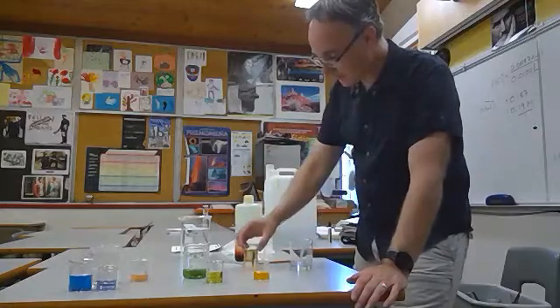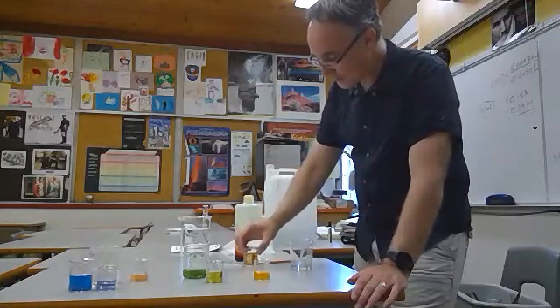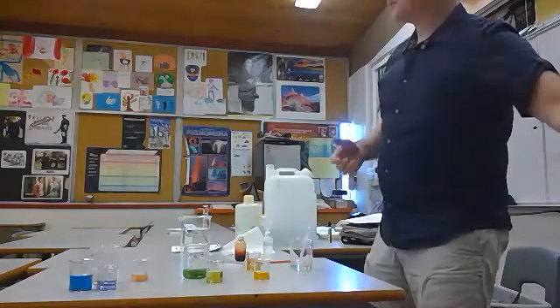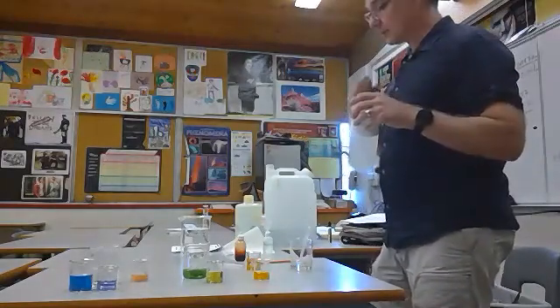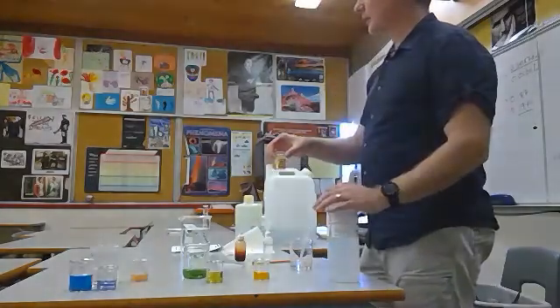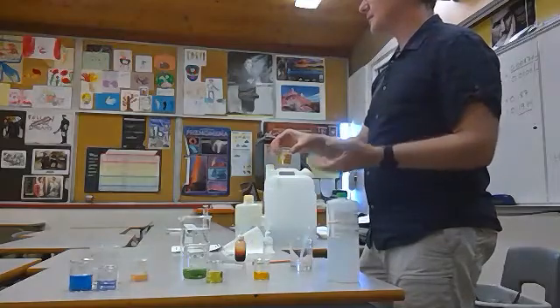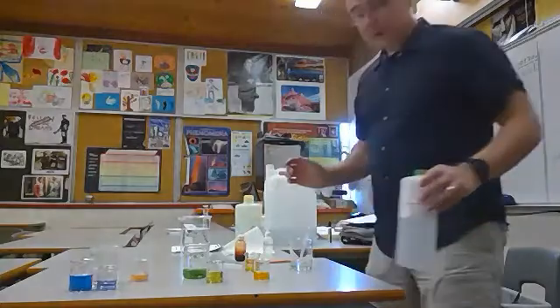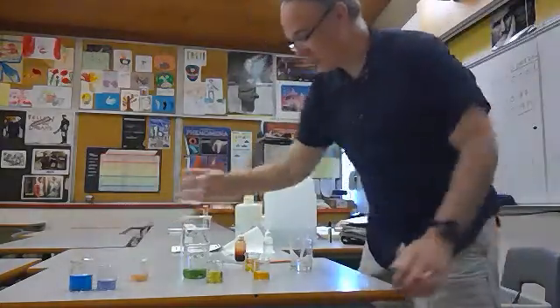I can overload the buffer. What just happened there is I added so much acid that I used up all the weak base that was in there. It's been completely converted to acid now. So the buffers don't stop pH changing altogether, they slow it down, they reduce the effect of it. But I can easily fix that by adding a bit of base to it. And my base here, I think, was this one.